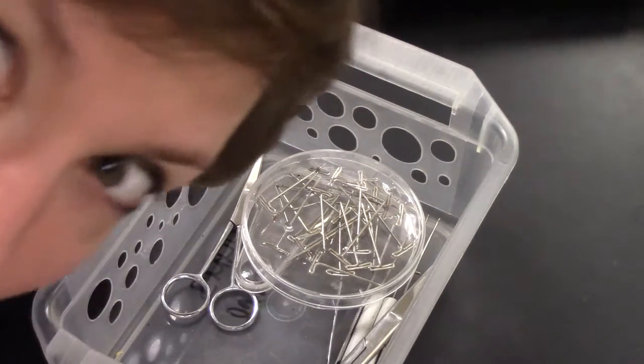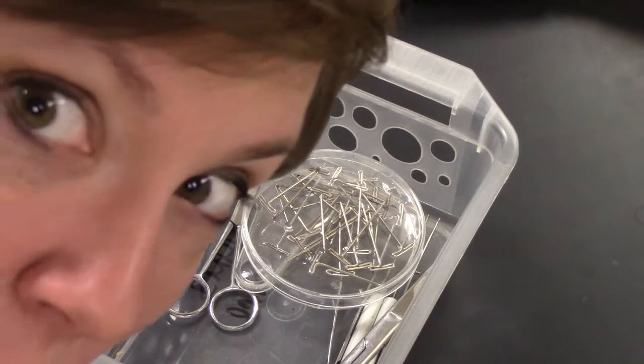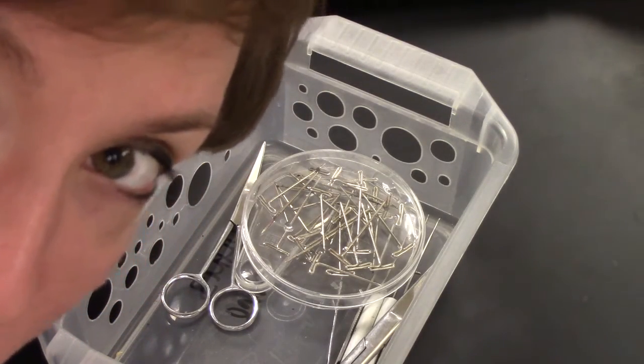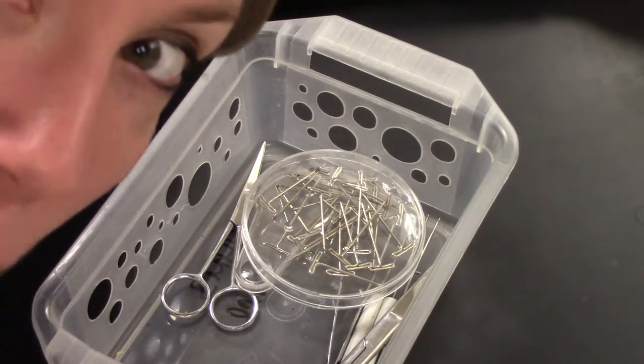Hello everyone. I'm going to walk you through a frog dissection, and this is probably the only time you're actually going to see me because I'm going to be working down here.